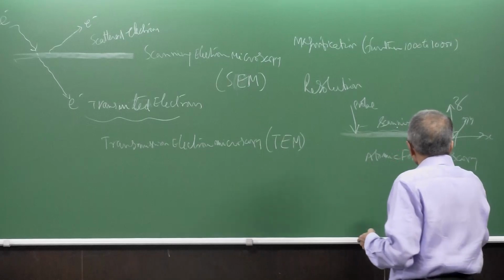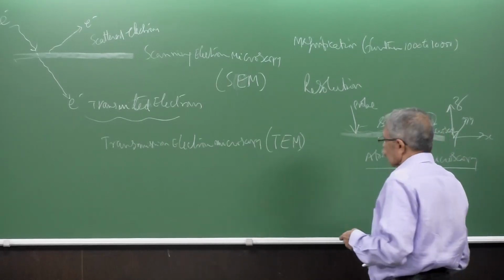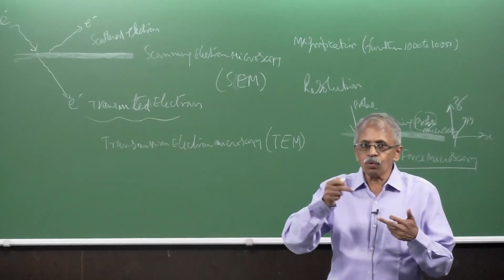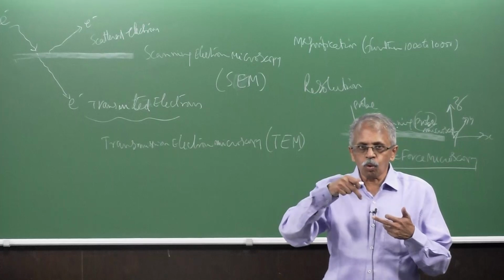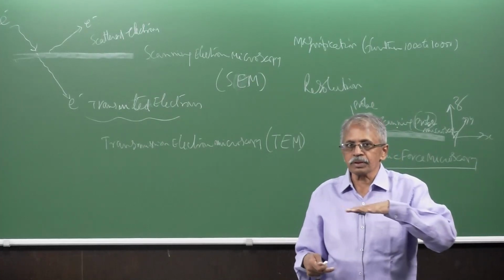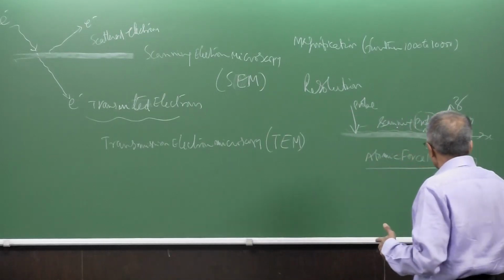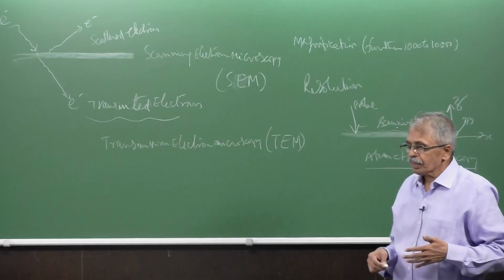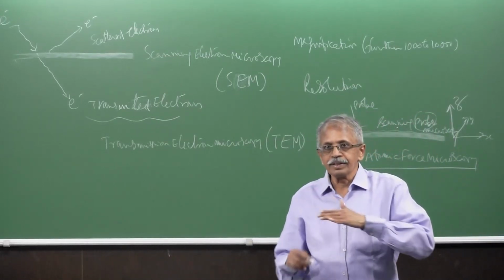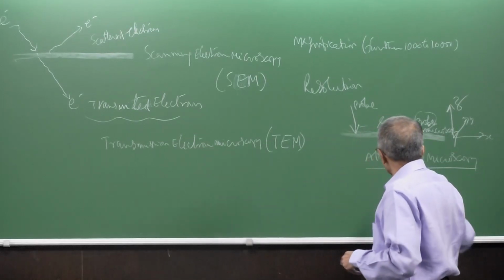A specific one is atomic force microscopy. So you're looking at the atomic forces, what kind of forces there are between the tip of the probe and the surface layer of your molecules, your atoms, your species. They will differ chemically, structurally, and in terms of the surface topology, so you can get all of those features.